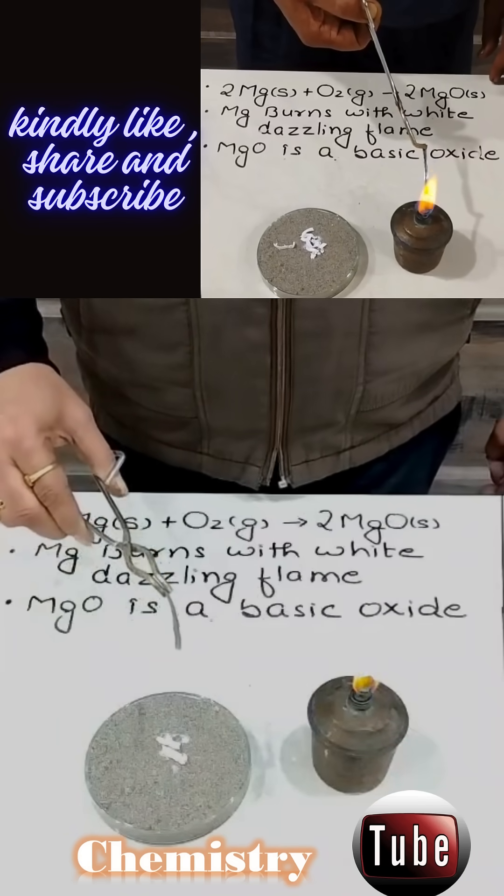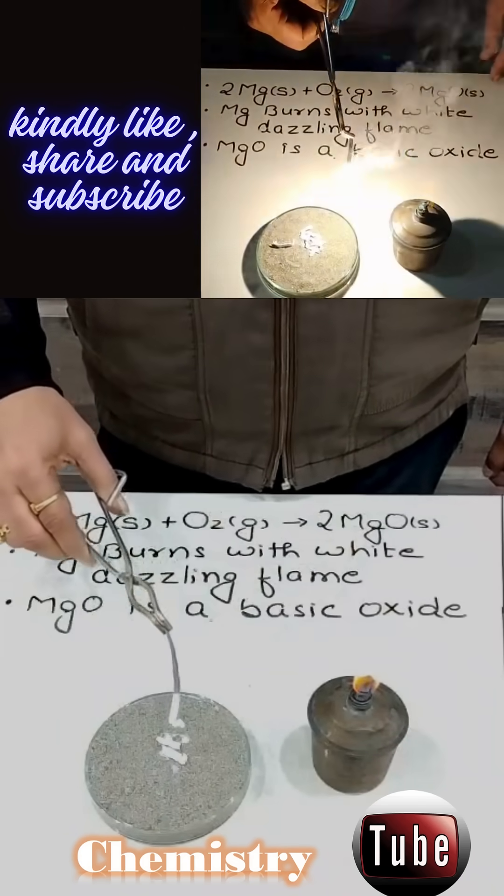Finally, it produces magnesium oxide. This is magnesium oxide which is a white colored powder.